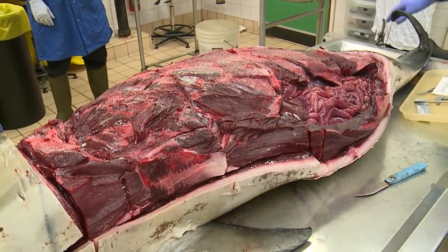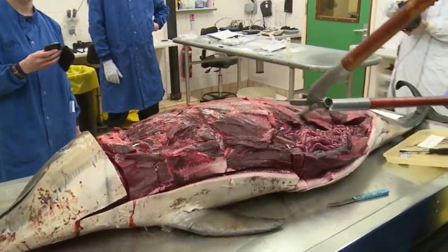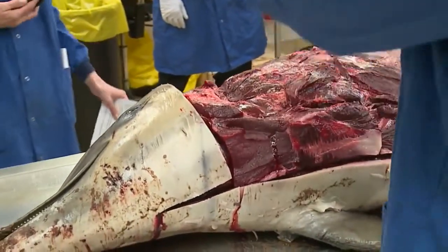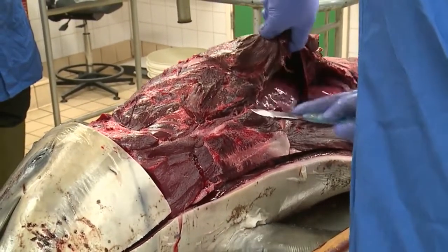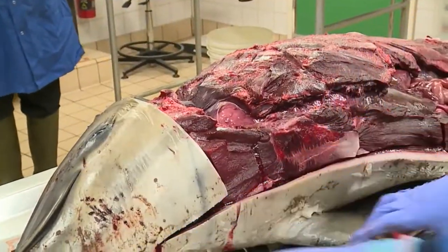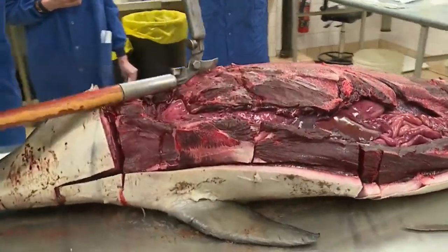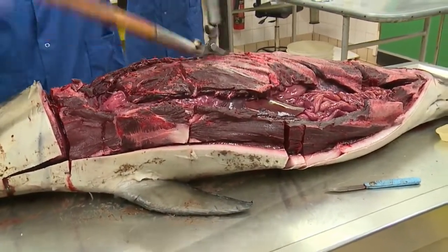Okay, so this is the gruesome sound effect time, I'm afraid. So we've had these for 27 years. £5, unmentioned DIY store. So we're going to just chop through the ribs on one side. So I'm just going to come behind you. Thanks. And then again, over here. Thank you.